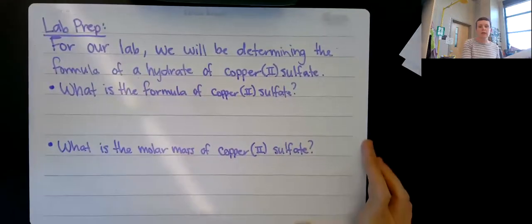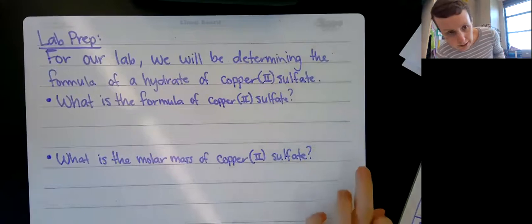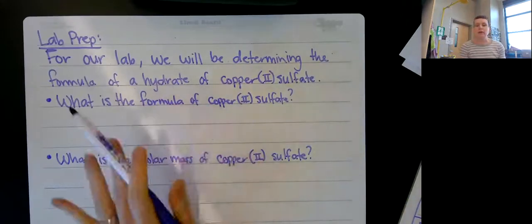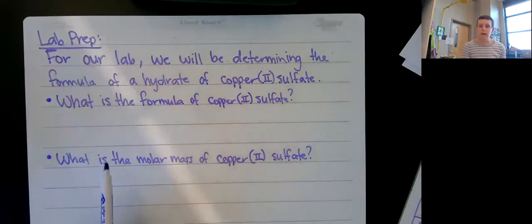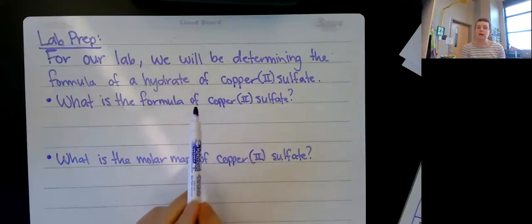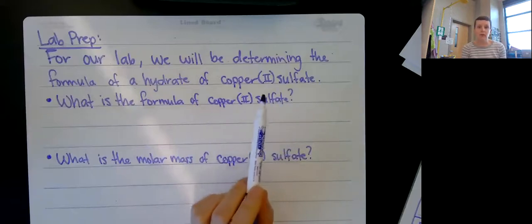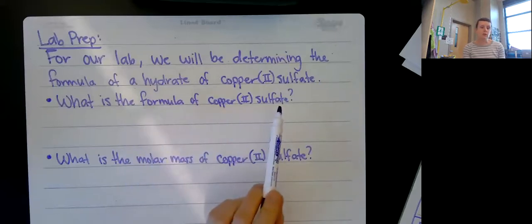Okay, we're going to do 2 little things to prep for the lab so that you're ready to do your calculations tomorrow after you get your data. The first thing is for our lab, and again, you don't need to necessarily copy the whole question here, but maybe put lab prep, and then you're going to put what I write down here in that section. So for our lab, we will be determining the formula of a hydrate of copper 2 sulfate. So we're not using magnesium sulfate like the pre-lab, we're using copper 2 sulfate. So first, what is the formula of copper 2 sulfate?